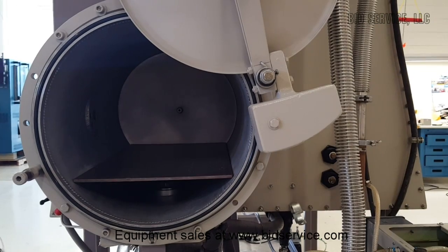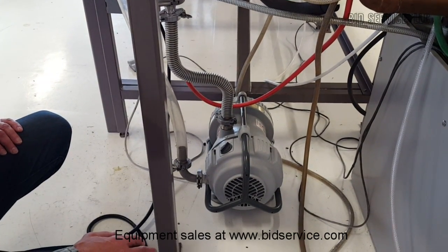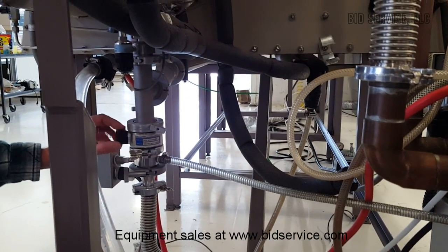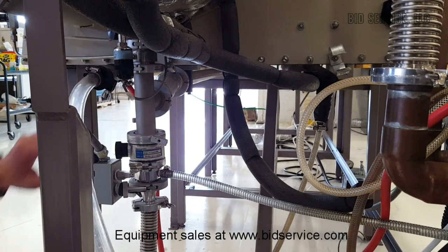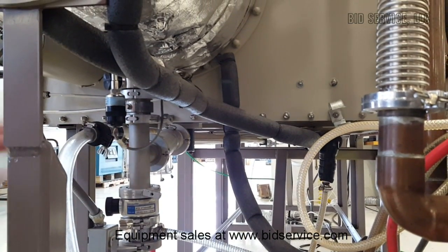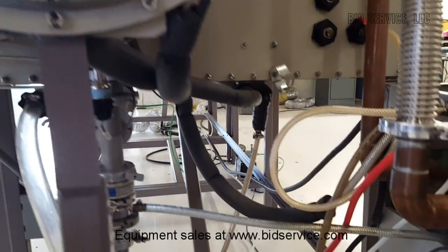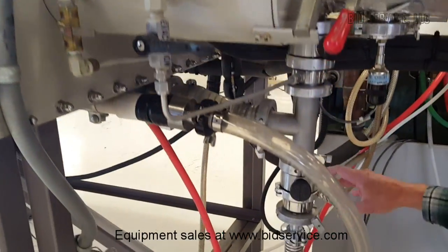We also have a dry scroll pump here — no oil in it — it's an Edwards XDS 110. We have vacuum coming in through here, a valve to open and close, and another valve over here that opens to your vacuum chamber. This vacuum line is sent all the way to the other side identically. You also have a vacuum port that leads up to your mini antechamber.